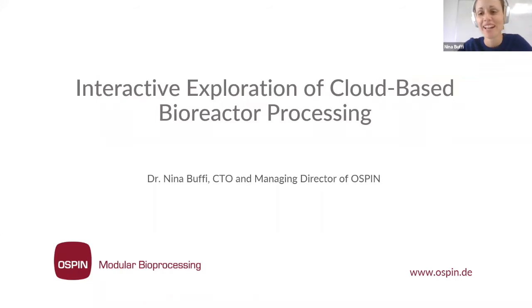Okay, wonderful. So I'm Nina, you know that now. At Ospin, we are automating and digitizing bioprocesses in different fields, mainly, as has already been said, in tissue engineering, cell therapy, and obviously cultured meat. So today I'm going to talk about control systems for bioreactors.